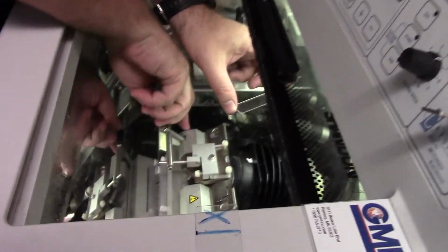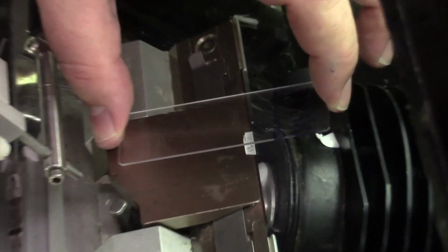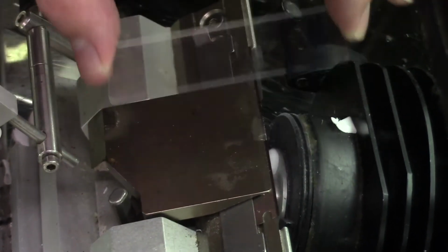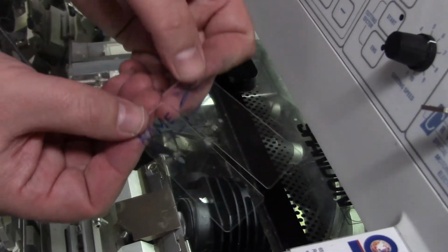Come on, Randy, you can do this. On your marks, get set, go. And there's my tissue section. Two pieces of tissue side by side. Our two slides look identical.